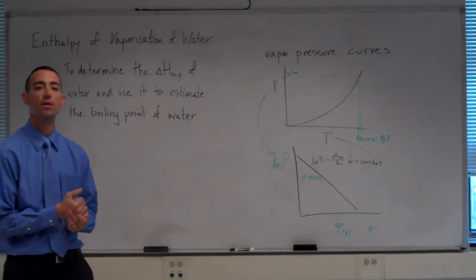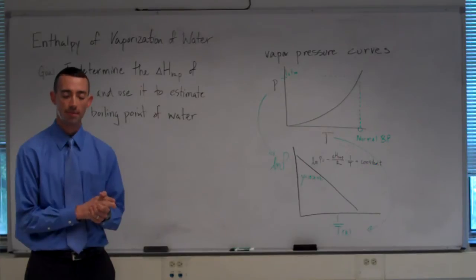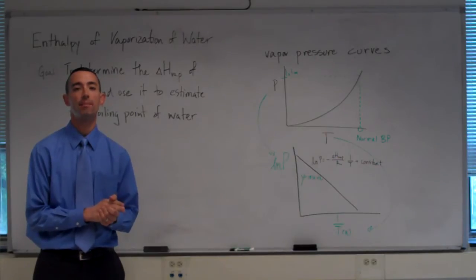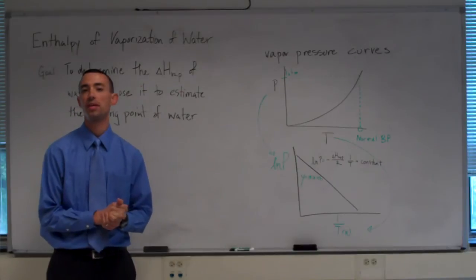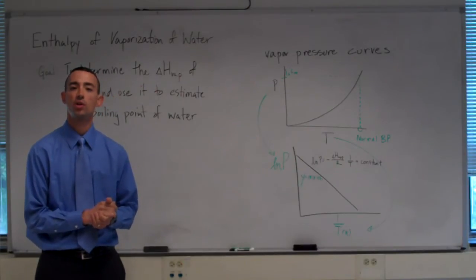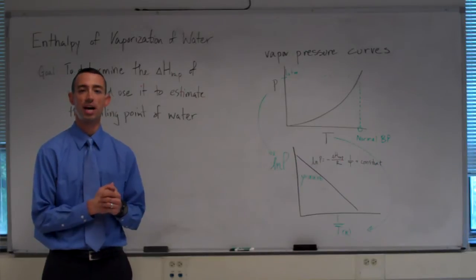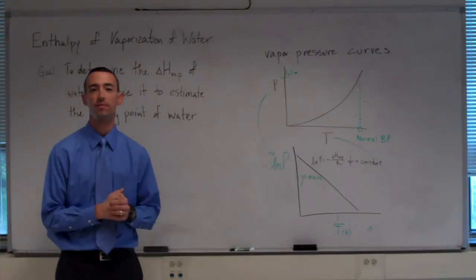Today I'm going to walk you through some of the theory that underlies the enthalpy of vaporization experiment, briefly show you the setup, and go through the pre-lab questions. We're going to make a separate video that will describe the calculations that you'll complete as part of this experiment, which are a little bit involved, and I hope you'll be willing to try them in an Excel spreadsheet to save you some time ultimately. So look for that video to show up as well.